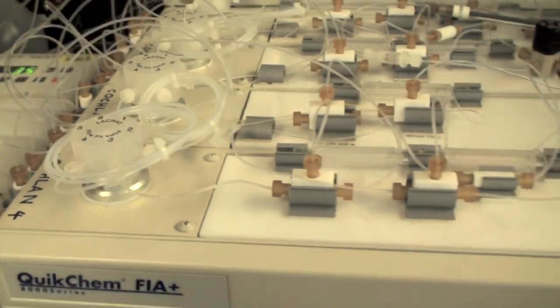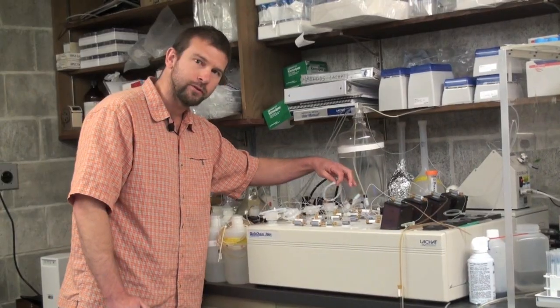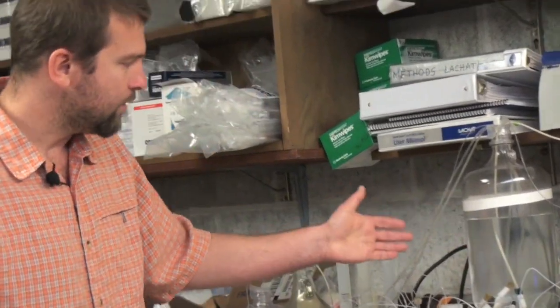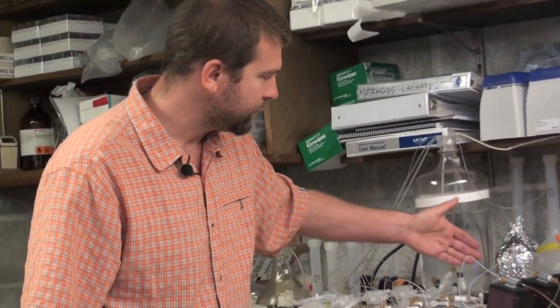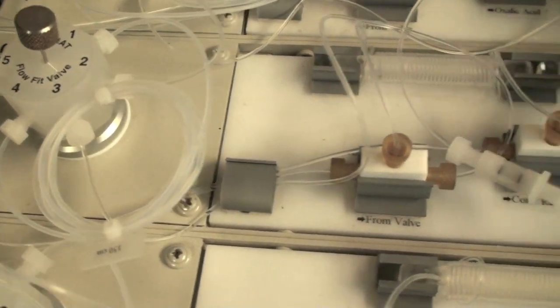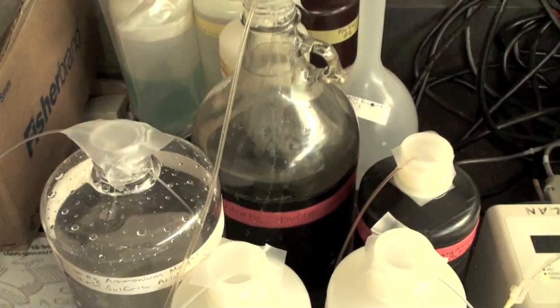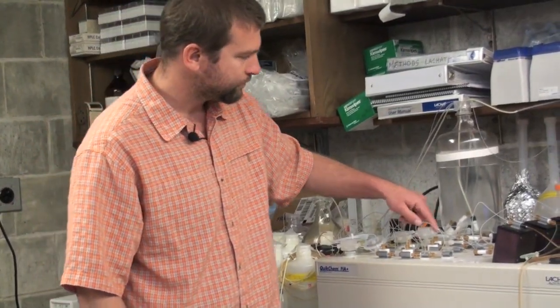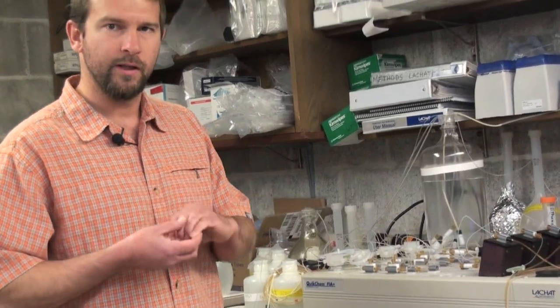There are four channels on this instrument. They are loaded up into these little loops and there are four of them. Then the sample will be pushed forward through these channels and mixed in all these little coils and at each one of these T's a little bit of chemical, a reagent, will be mixed in with the sample and as it mixes a color will develop.